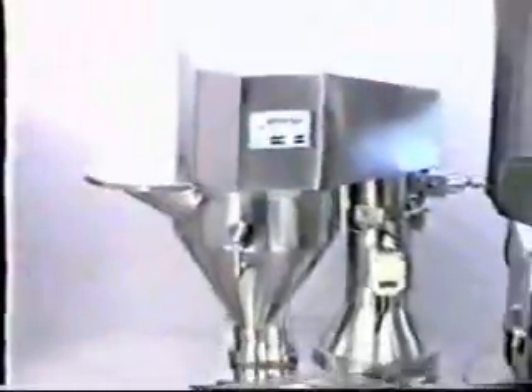We are sure that this video will help you to understand your capsule filling machine.